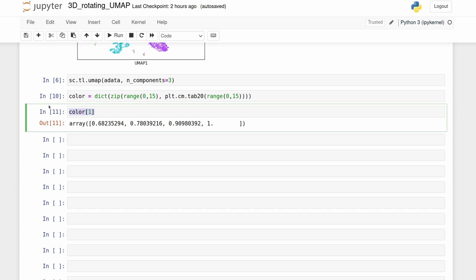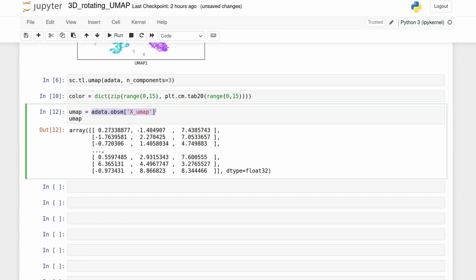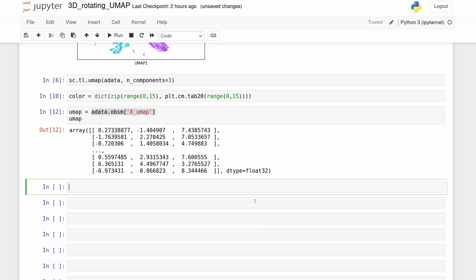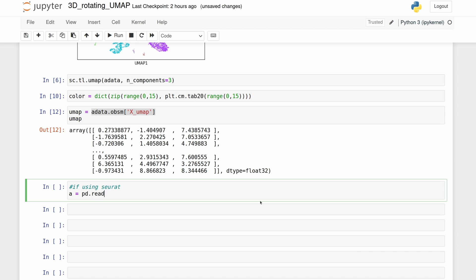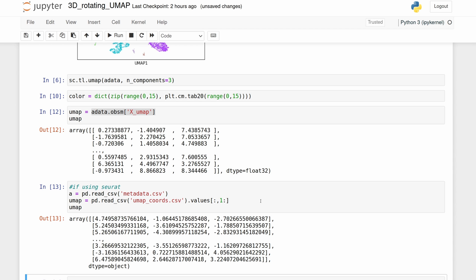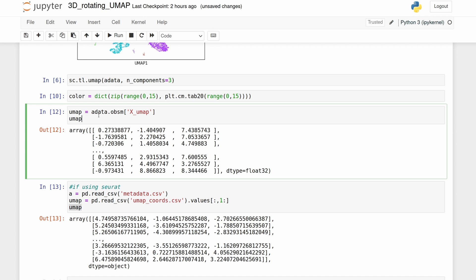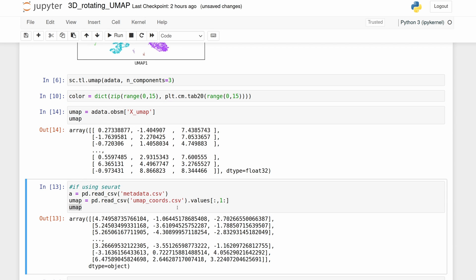Next let's get the UMAP values from the adata object. We're just pulling it out and you see that it's just an array with x, y, and z values for each cell. Let me just show you what you would do if you were using Seurat here. Again, we just see that UMAP is the same 3 by 10,000 cells, just x, y, and z. But of course, we're going to stick to using the Scanpy object here.